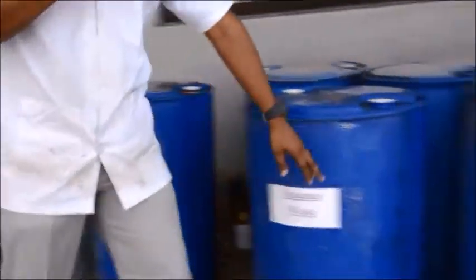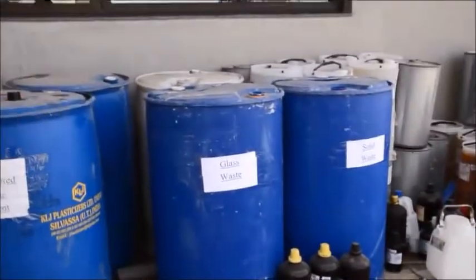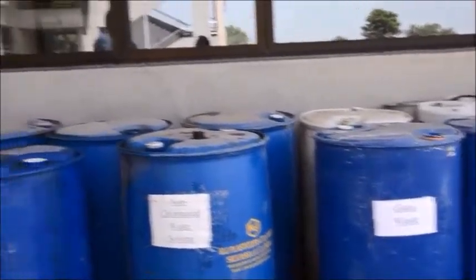Hi, I'm a research scholar at IIT Gandhinagar, and I'm here to give a brief idea of how we are maintaining the solvent and aqueous disposal system. So that's the safety concern here. Here we have the different solvent drums: chlorinated solvents, aqueous waste, non-chlorinated waste, glass waste and solid waste. All of the different materials have been segregated properly for safe disposal.